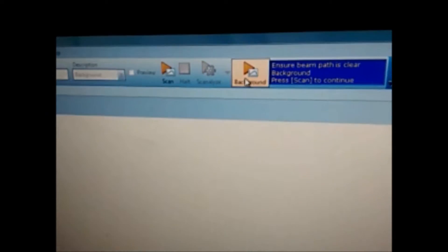To do that, in our instrument we have a background icon over here, and we just click on that. What this does is it takes a scan of the background to cancel from the FTIR that we're going to get for our sample, to give us more accurate results.